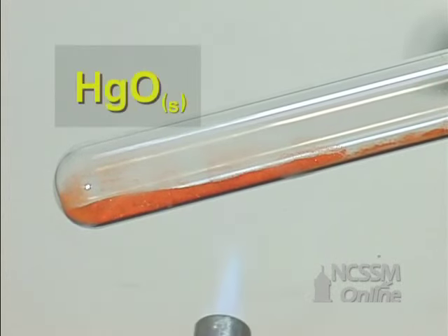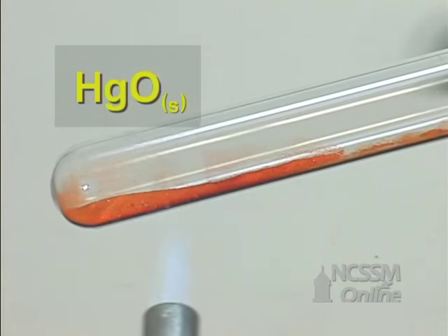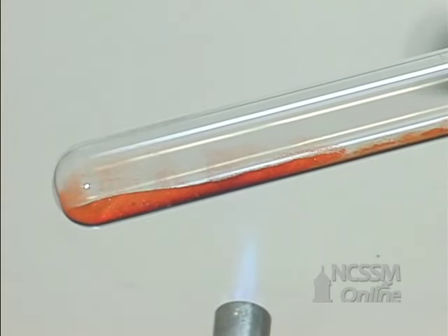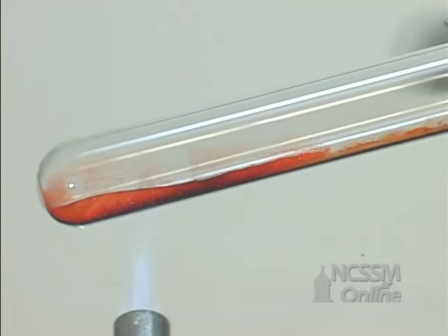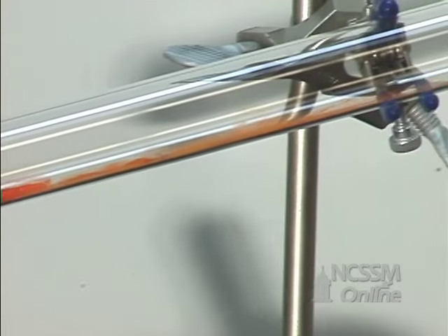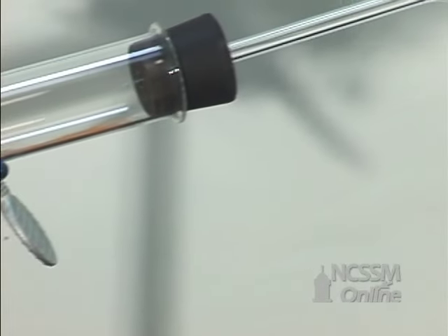In the test tube, we have a sample of red mercury oxide. We will heat the sample and it will decompose to give mercury metal, which will condense at the top of the test tube, and oxygen gas, which we will collect by the displacement of water.